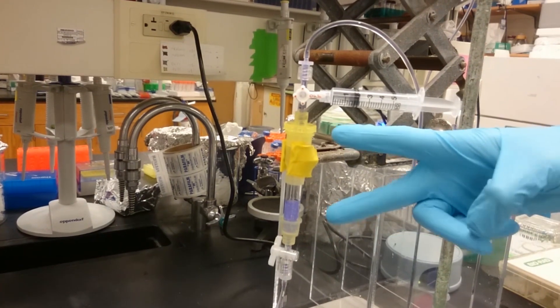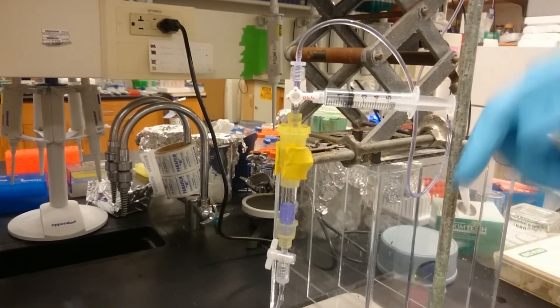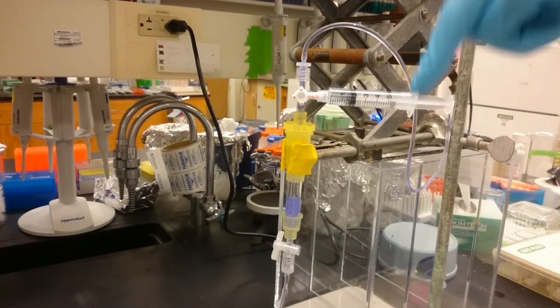Essentially what you need is to have an airtight connection between the top of the column and the reservoir, and therefore every drop that leaves the bottom will pull another drop in from the top.